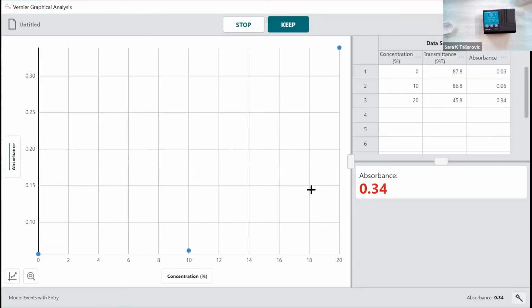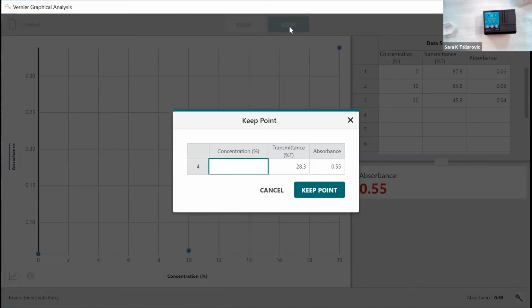As I mentioned, this is actually just the lab that appears right before the lab on osmolarity and pH. The one that I didn't demo today was pH, but the results are nice. You can also find the pH range. You're going to see more U-shaped data for the pH test. It's going to be a little bit more similar to the salt. And you'll see more linear data when you look at things like alcohol or detergents.